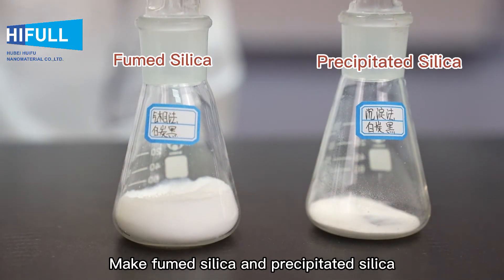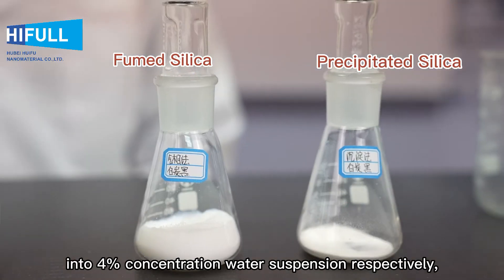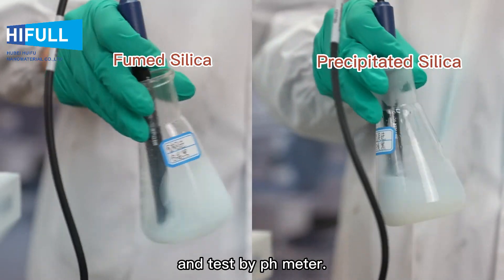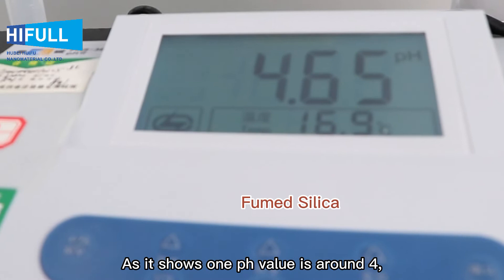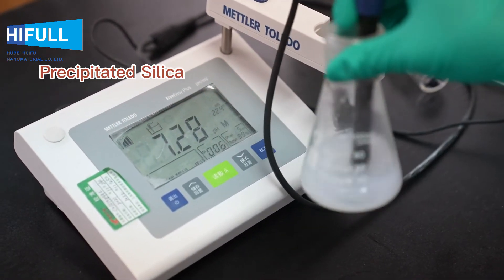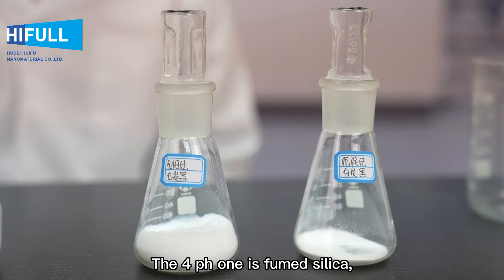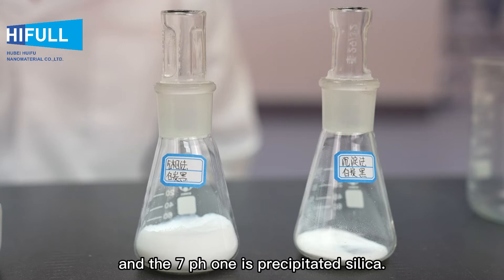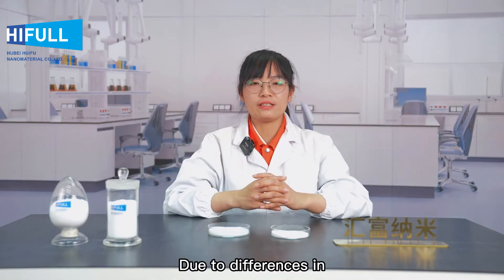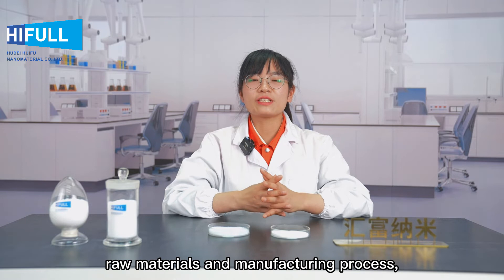First: pH test. Make fumed silica and precipitated silica into a four percent concentration water suspension respectively, and test with a pH meter. As it shows, one pH value is around four and another is around seven. The pH four one is fumed silica, and the pH seven one is precipitated silica.